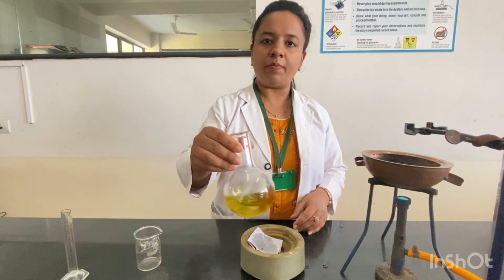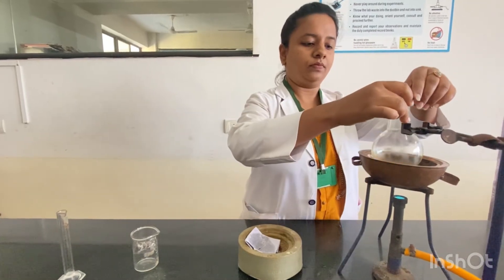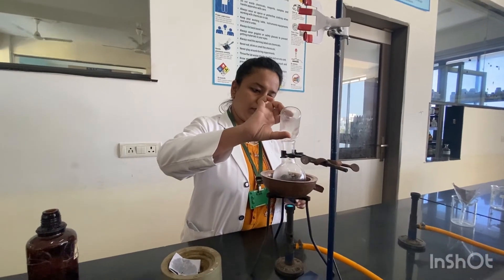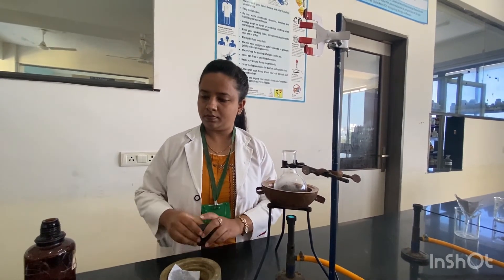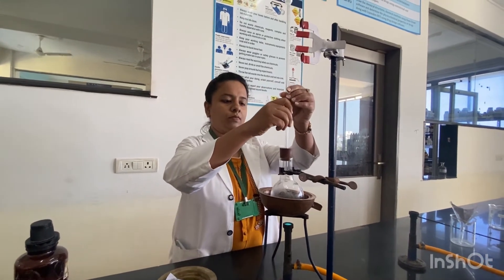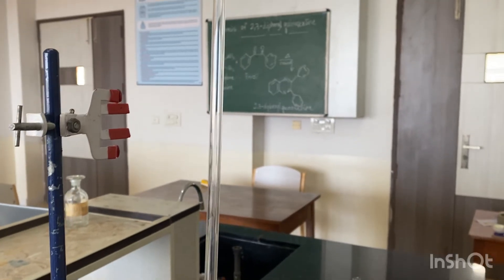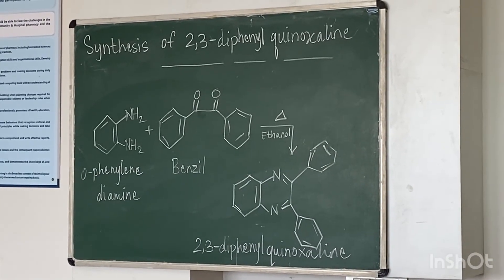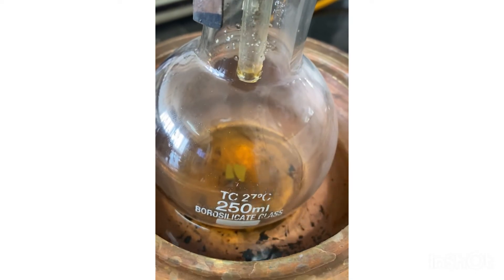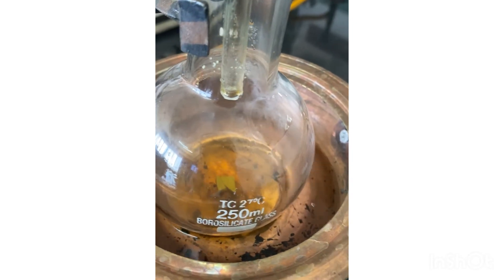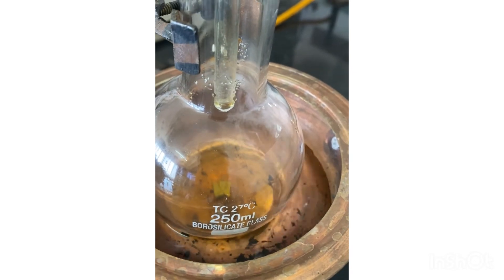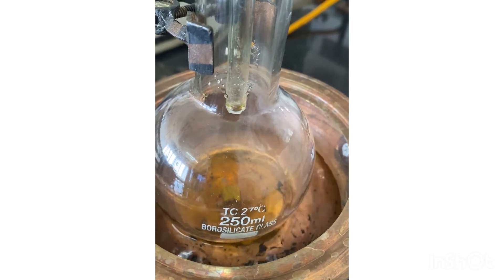We are going to keep it on a water bath for a period of 30 minutes. During the entire procedure, care has to be taken that the solution should not get boiled, because if it boils too much the ethanol is going to get evaporated. We can continue with the procedure by turning off the burner for a few minutes and then putting it on, and in this way we can complete the synthesis procedure for a total of 30 minutes.